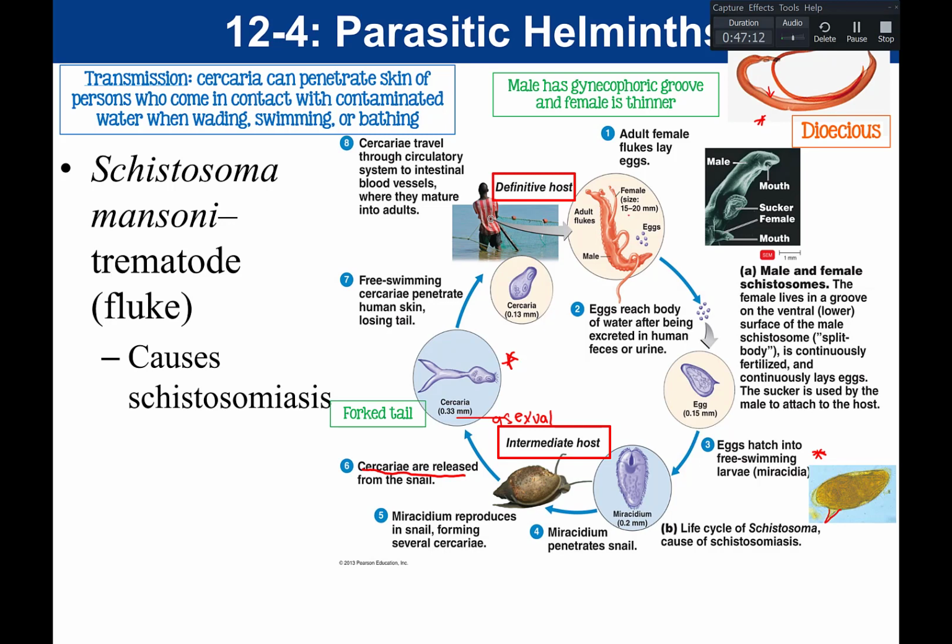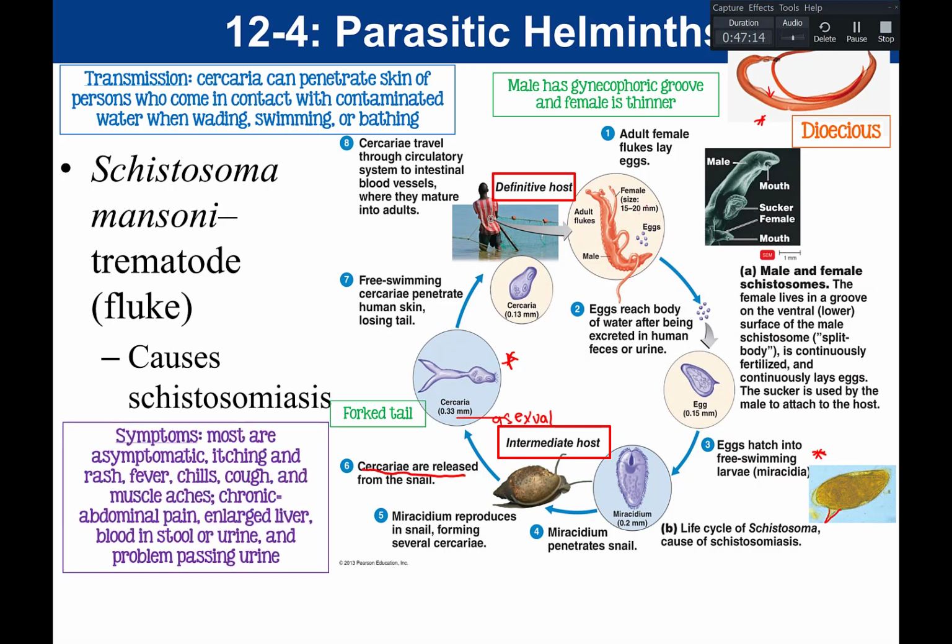In terms of size, it says here, so the females are about 15 to 20 millimeters in size. That comes out to 1.5 to 2 centimeters. So about double the length of Enterobius, for example. The males are slightly smaller in terms of their length, but they are wider.